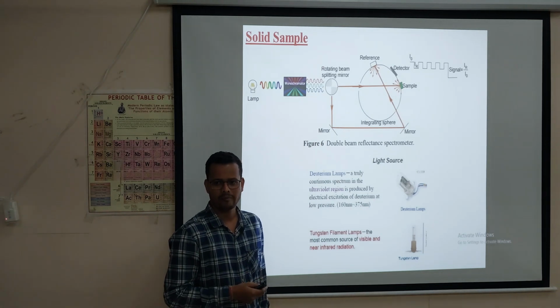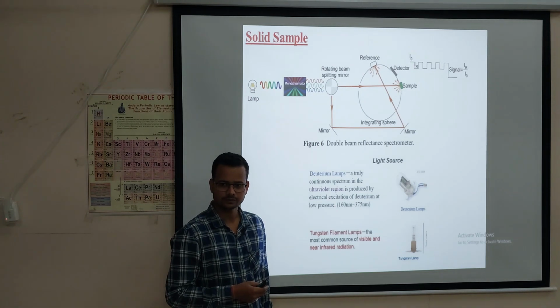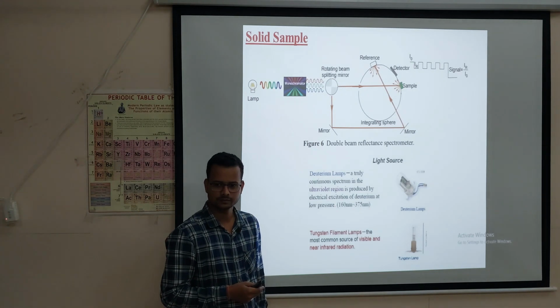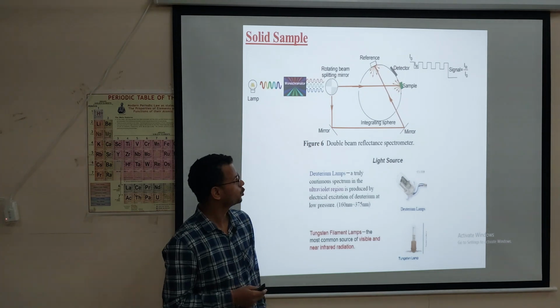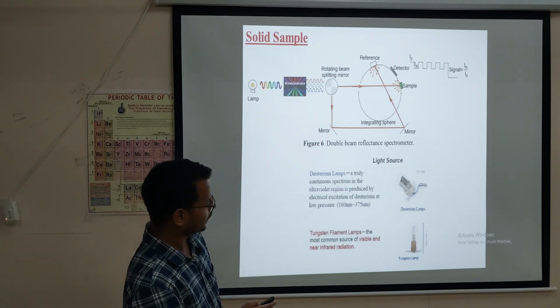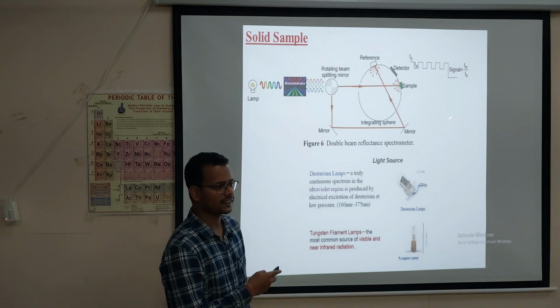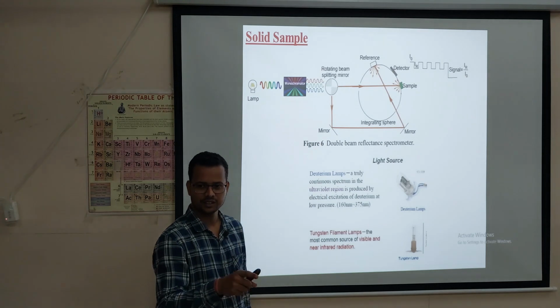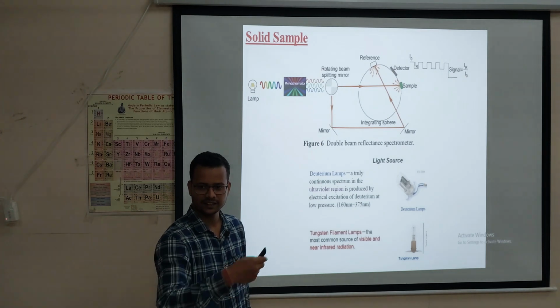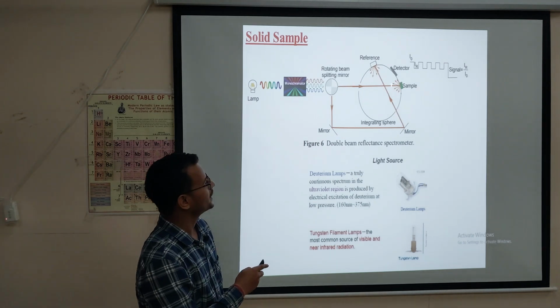One more thing: there is a signal IR, I naught. What is that? Please explain. It is your incident ray and reflected ray. I0 is incident, IR is reflected. A graph like this you can get.